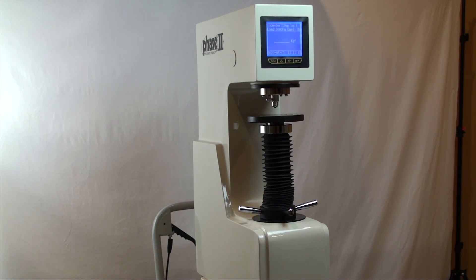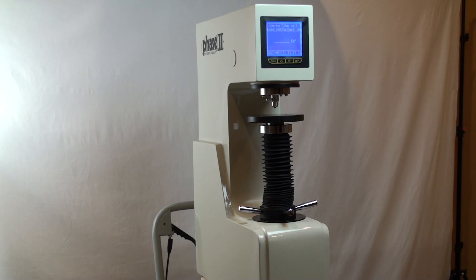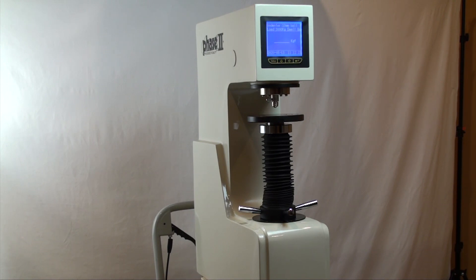Let's begin with the unique design of this series Hardness Tester. The maximum height of the workpiece testing is 230 millimeters or about 9 inches. The maximum depth of workpiece is 140 millimeters or about five and a half inches.